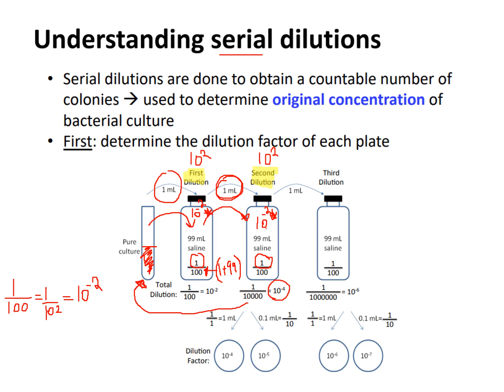So far, you've diluted it twice, and each time it's 10 to the 2, right? So, meaning that total, you've diluted it 10 to the 4. That original sample right here, so far, you've diluted it 10 to the 4.